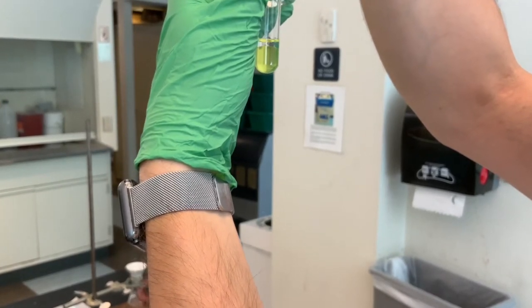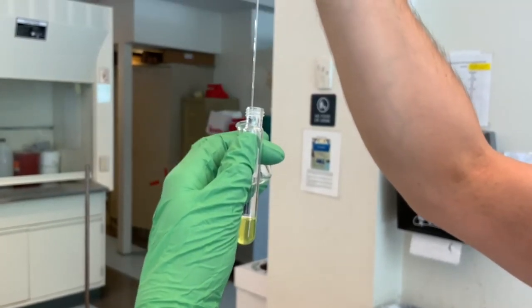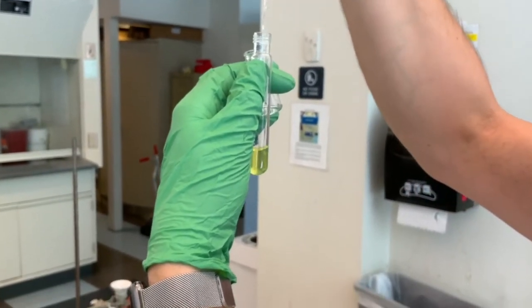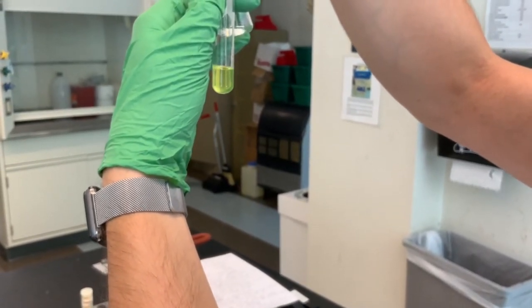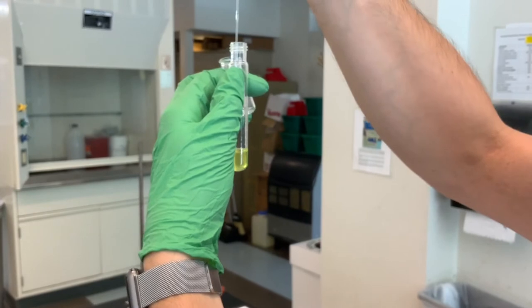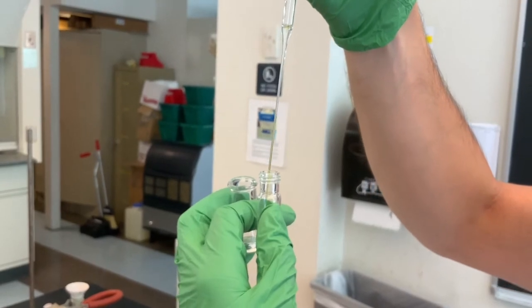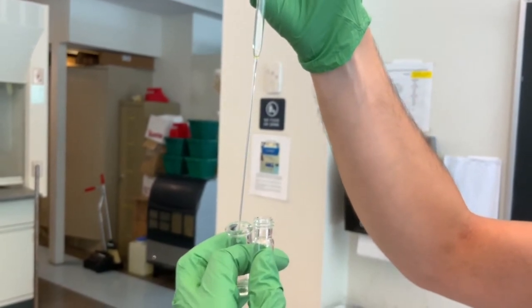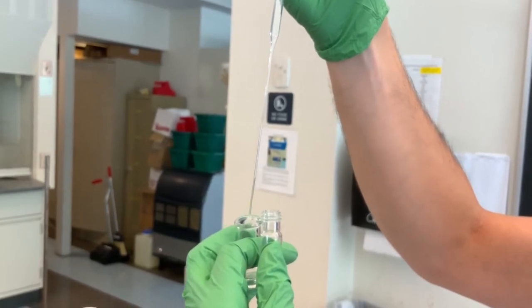And I'm trying to be as careful as possible to not draw up any methylene chloride. The nice thing about it is that if I accidentally do, I'll see that it is yellow and just dispel it back into my culture tube. But sometimes this happens where the layers get somewhat confused, due to the density factors. So now you see I've drawn some up purposefully in my Pasteur pipette, and I'm going to get rid of that organic layer. And then I see this is now aqueous. And then very slowly we see that little bit that hung above the meniscus.